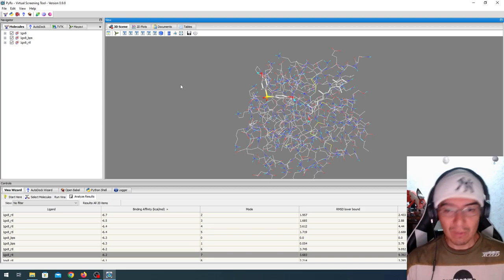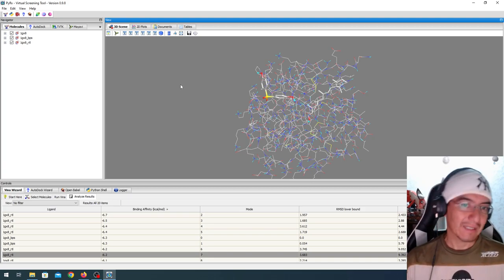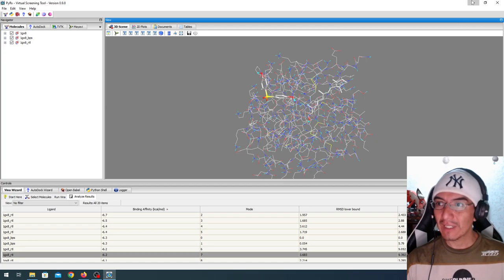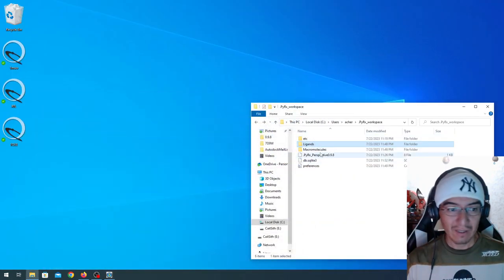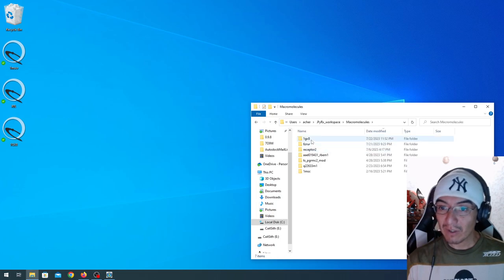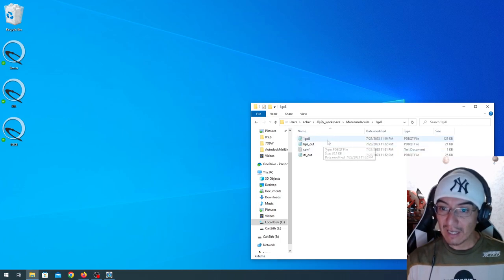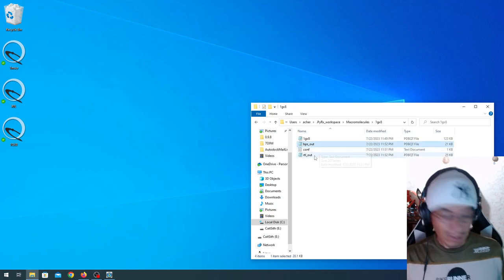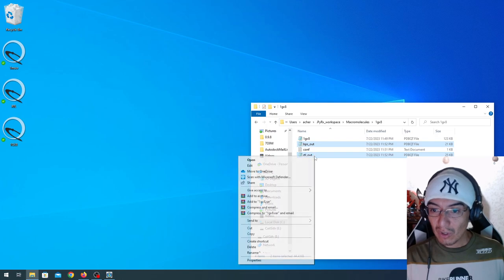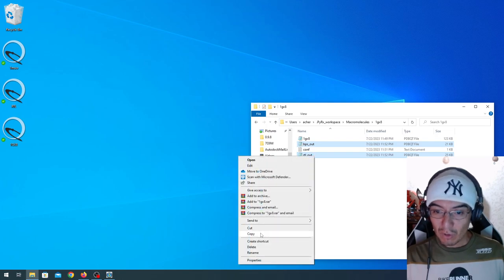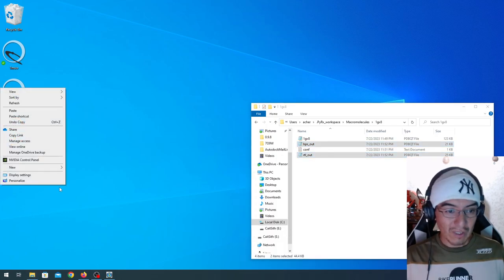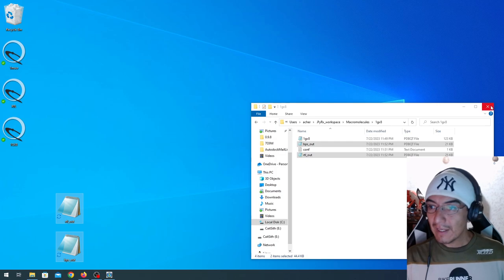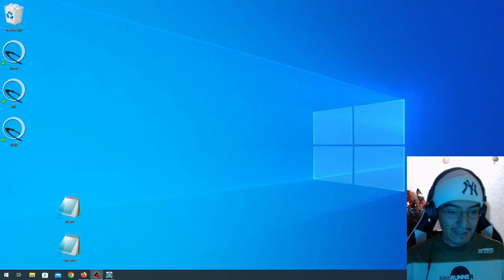Running, preparing, executing, that is super easy here. For the analysis, I will actually go here to the macromolecules. Inside the 1GXA are the results labeled as out. And I'm going to copy those to the desktop. And this, I will always prefer to analyze with Chimera.